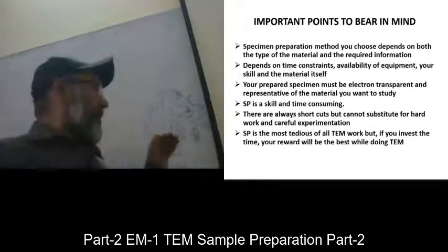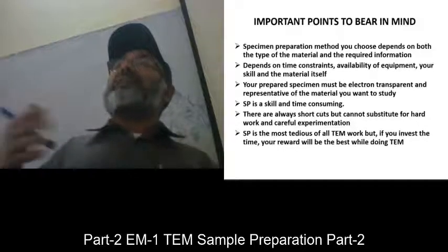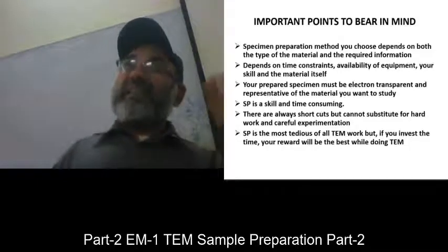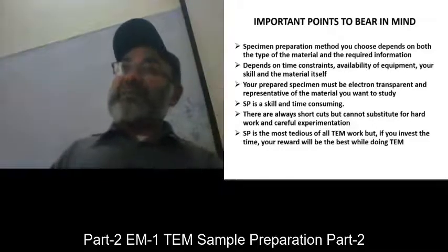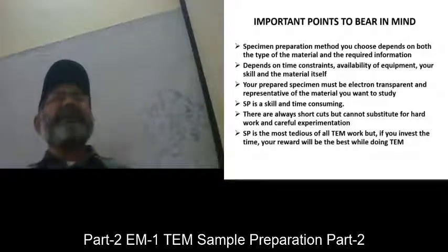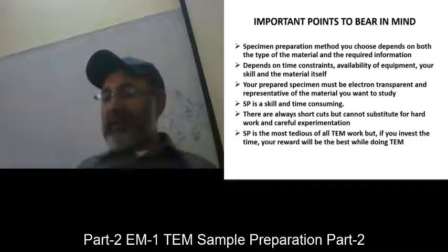But if the sample is completely crystalline, then that worry is not so significant. If it is a single phase and there is no glass or other phase, but in practice, usually when you deal with samples, some ions are volatile, right?